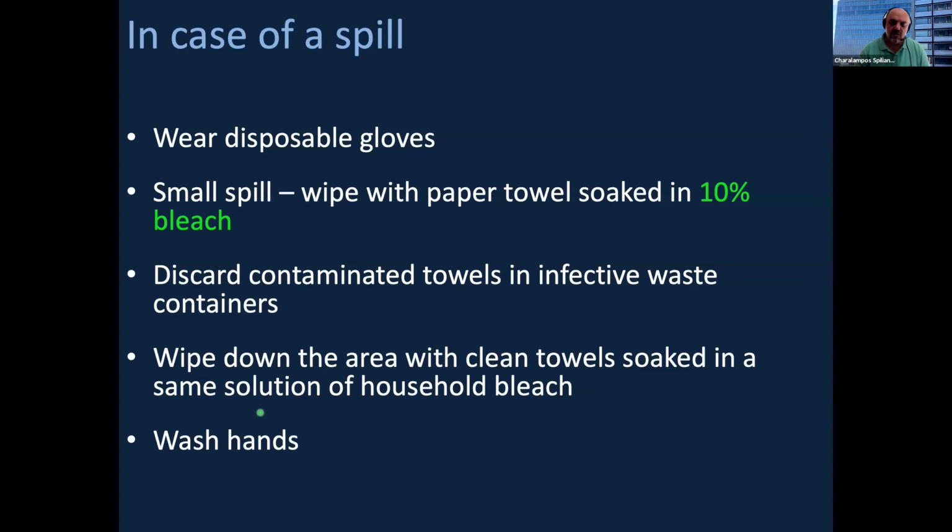Most people, I guess, don't know that, but 100% ethanol is not good, because organic solvents are not great for dissolving biological materials such as microorganisms, such as bacteria. What you need here is a certain fraction of water, because most biohazardous materials such as microorganisms are dissolved in water.